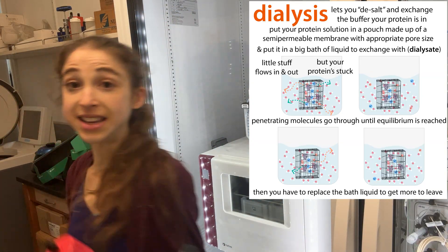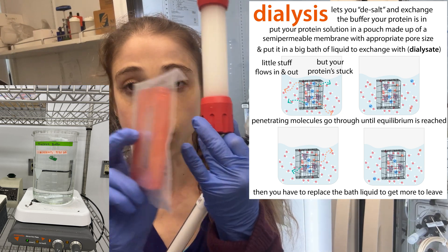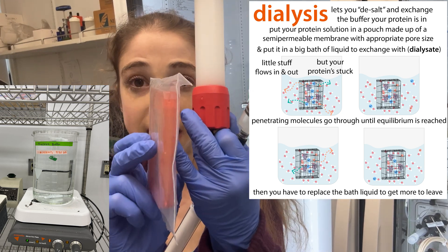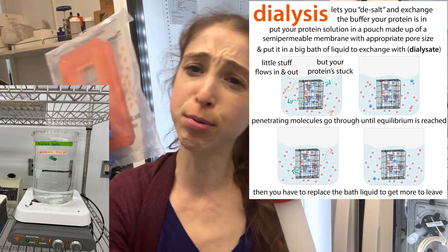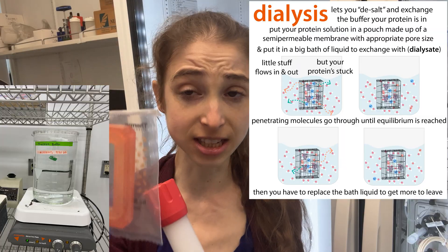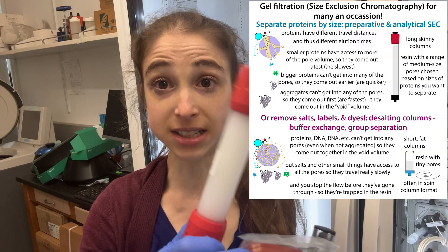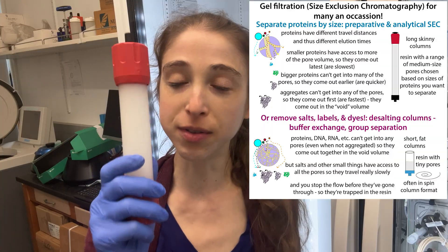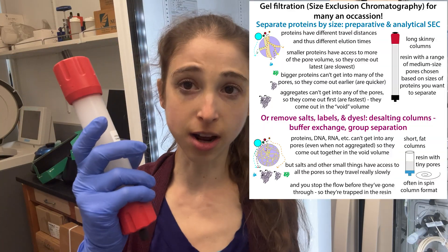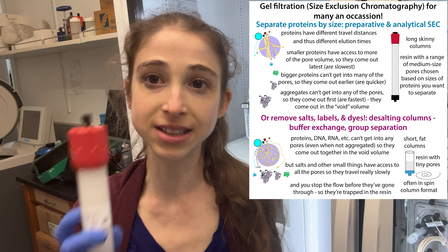So you're exchanging the buffer and getting rid of the salt that was with your protein originally. It's an alternative to dialysis, where the small things diffuse through a membrane away from your protein, which stays put in the dialysis pouch. In the case of this desalting column, everything is moving, but the big stuff moves faster — and as long as you separate your protein from what comes out later, you're able to remove that salt and other unwanted material.